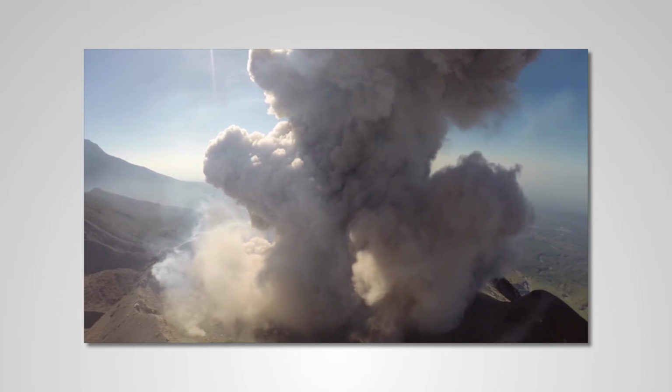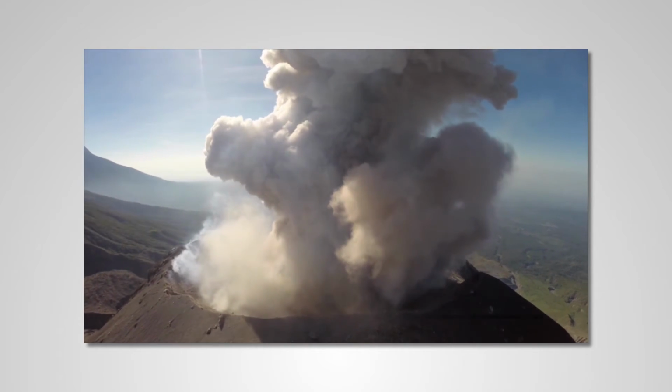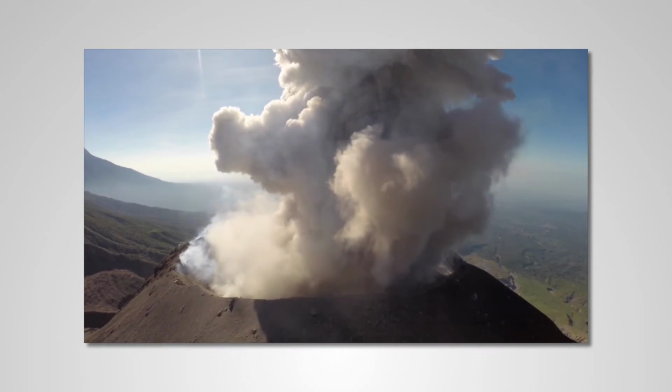Using X-ray tomography at high temperature and pressure lets us look inside volcanic magma to understand how bubbles and cracks form in the structure. This research helps build understanding of processes under the Earth's surface that lead to dangerous volcanic eruptions. Our tomography research is also vital for understanding many other important areas, from industrial processes like solidification of metals to designing implants for bone regeneration.